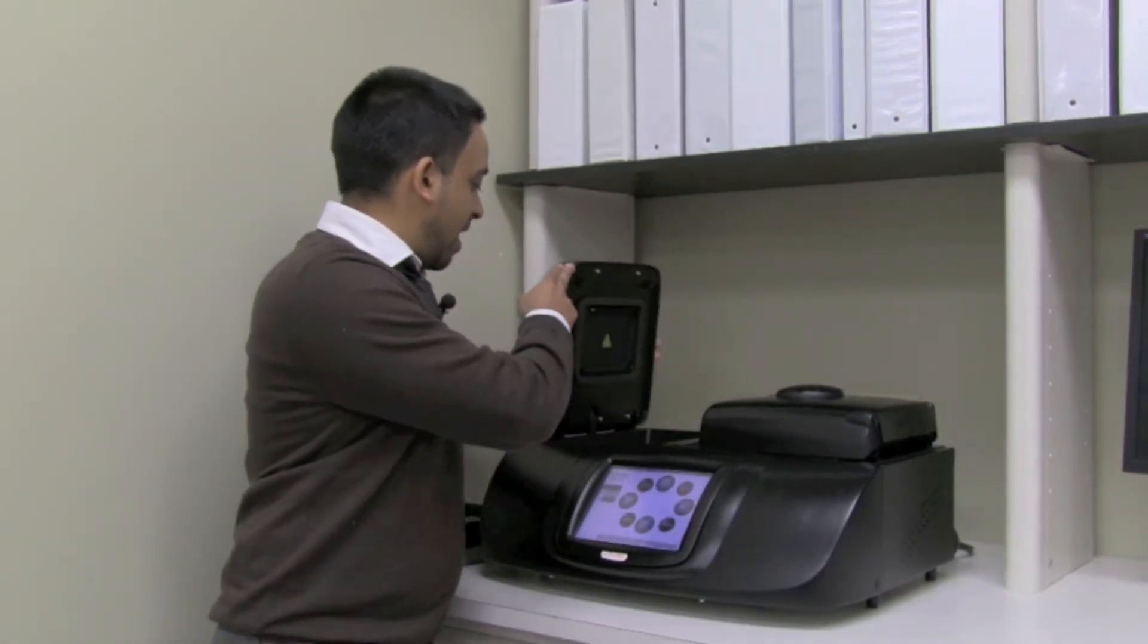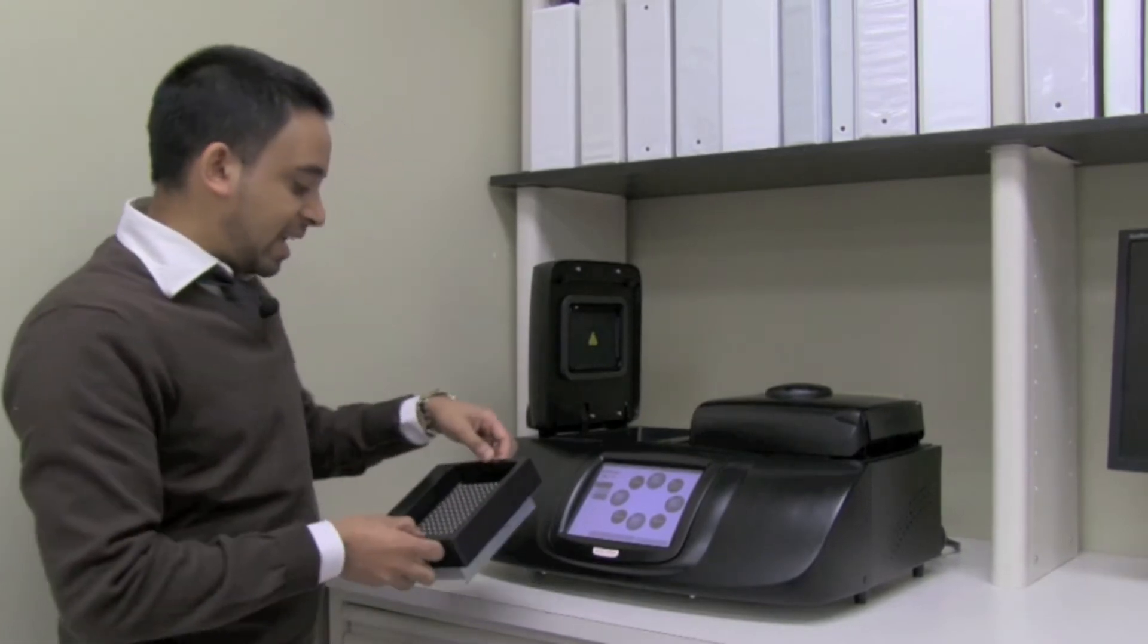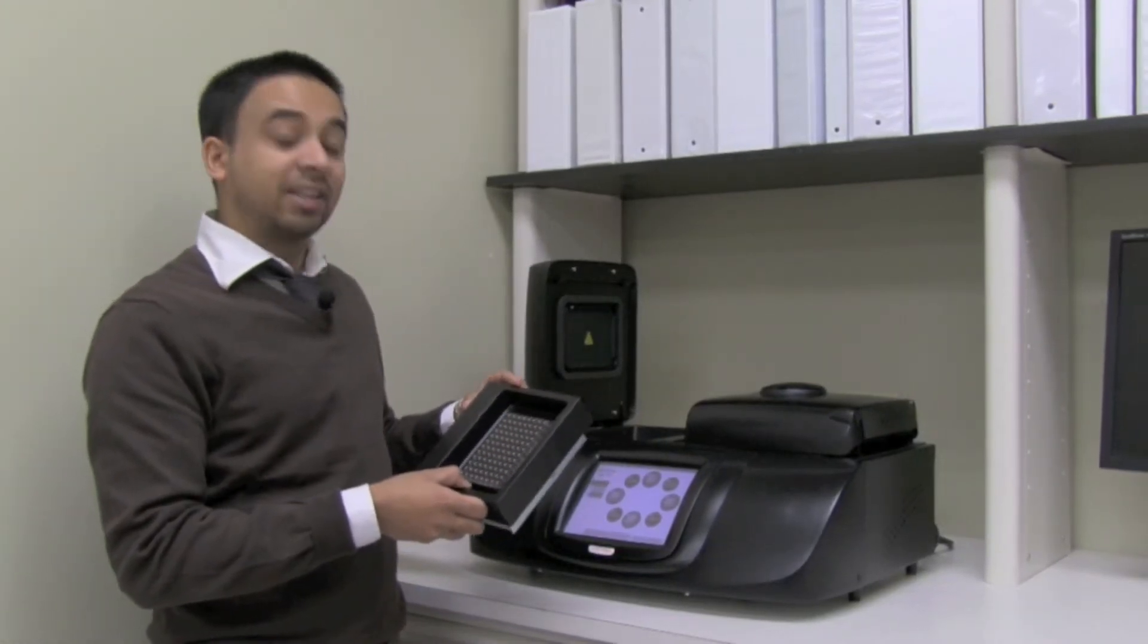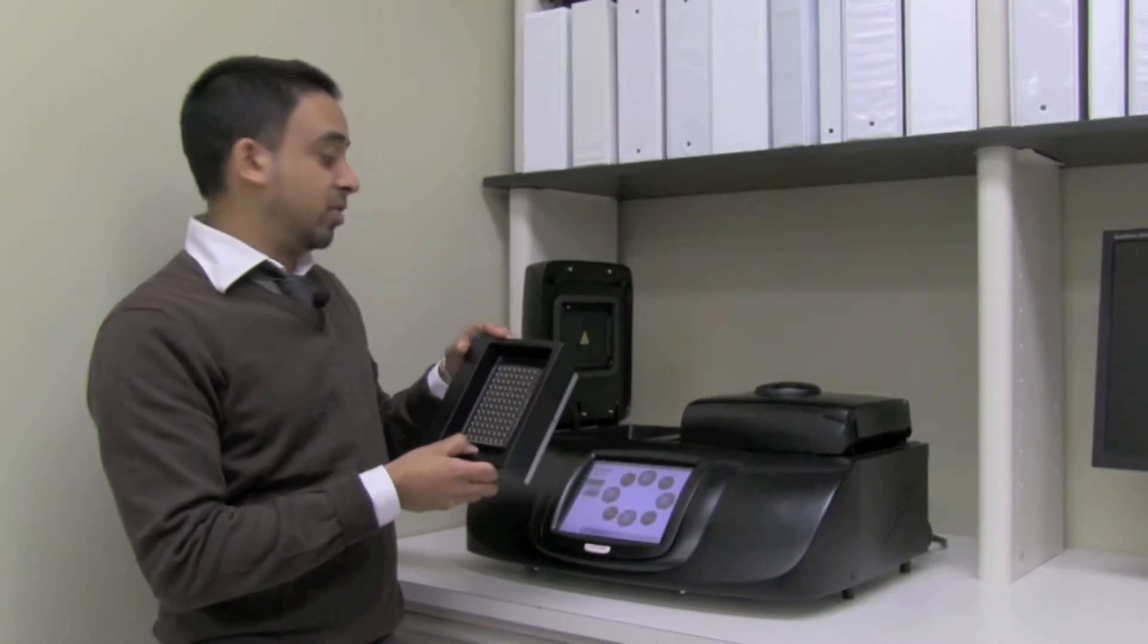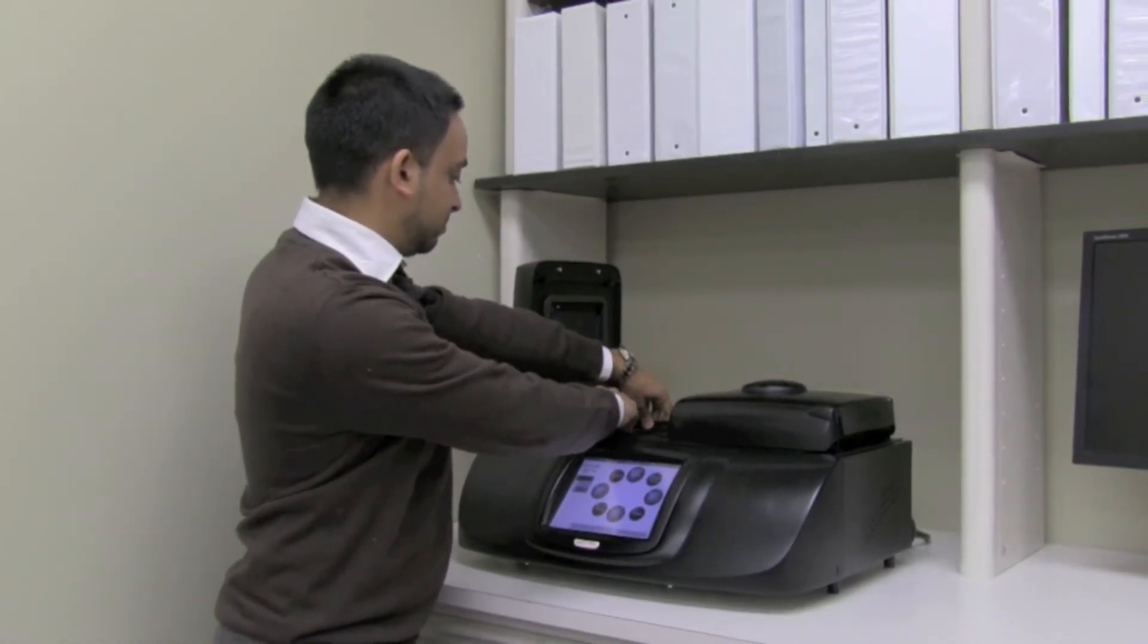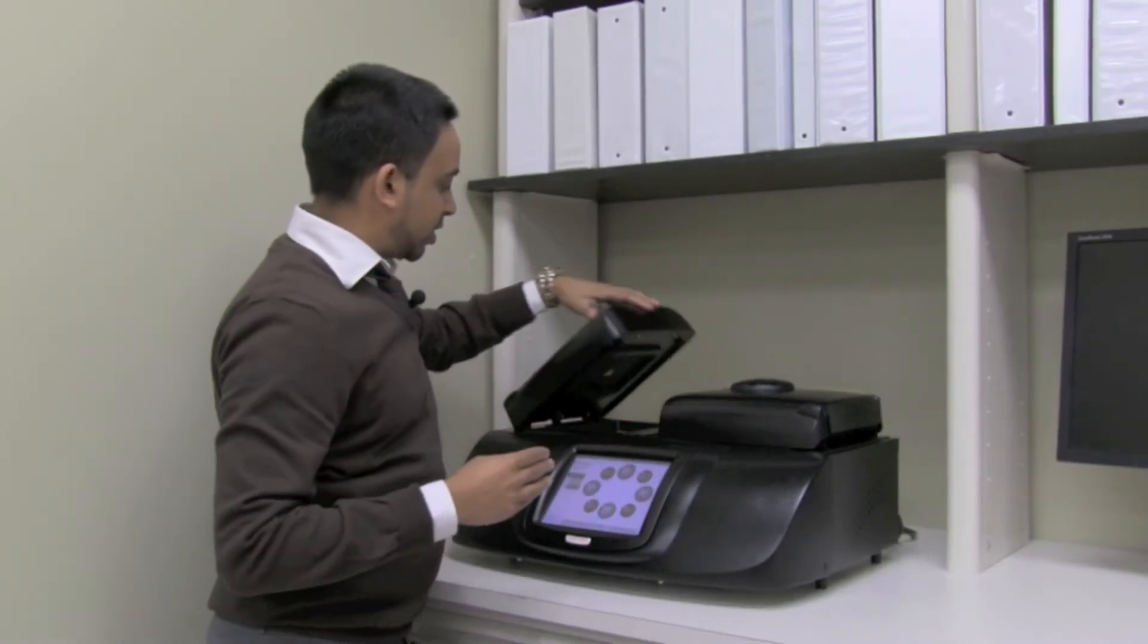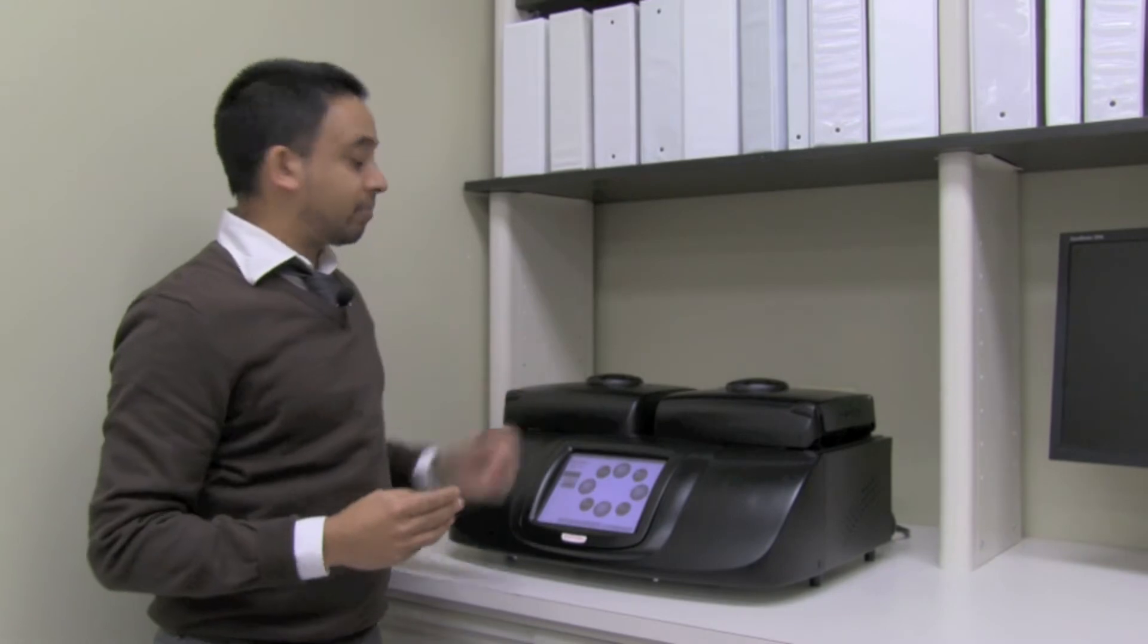This reduces mechanical wear and is obviously a lot simpler for you to use. I actually have with me the 96-well block for this unit. It inserts very easily. Simply place into place here and lock, then simply shut the lid to lock the unit. It's that simple.